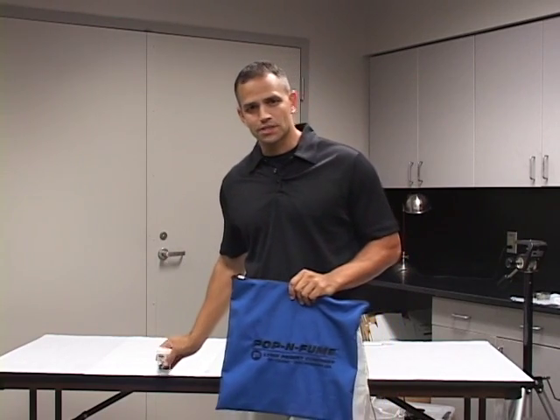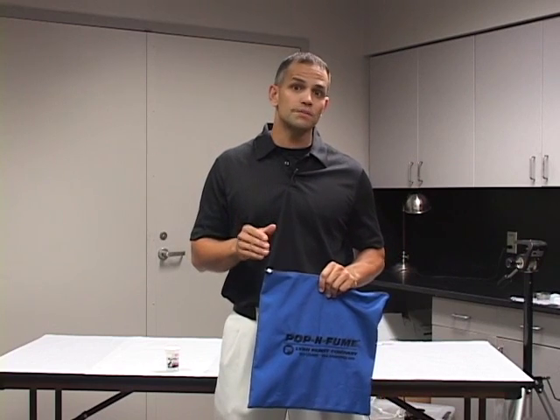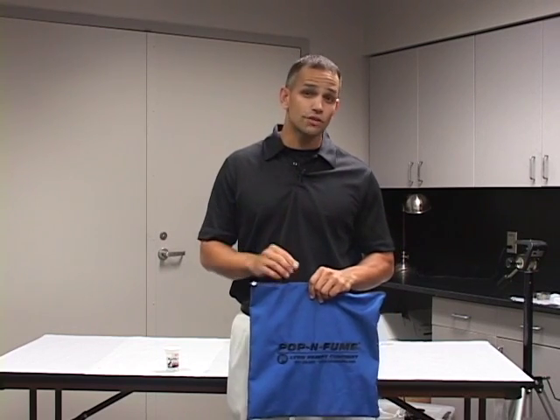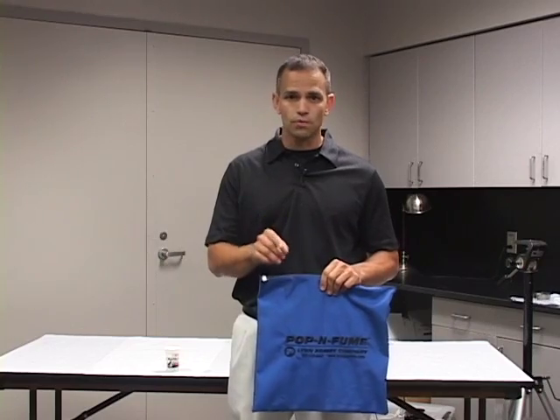Now before we get started, if you're unfamiliar with fingerprinting and superglue fuming, I encourage you to see my other videos on how and why we superglue fume and fingerprint, because today we are just going to focus on the superglue fuming and making it easier and portable for you.